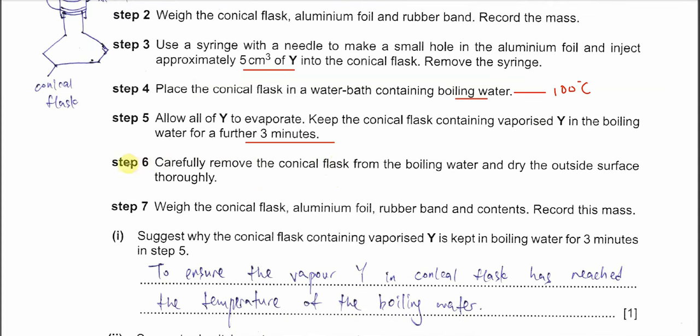Now, step 6. Carefully remove the conical flask from the boiling water and dry the outside surface thoroughly. So this is the second last step. Okay, last step: weigh the conical flask, aluminum foil, rubber band, and the contents, meaning the Y that formed the vapor.